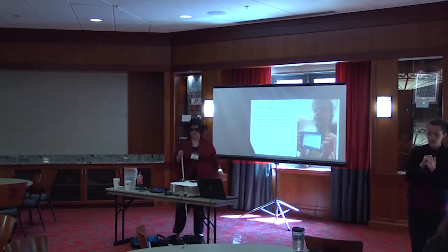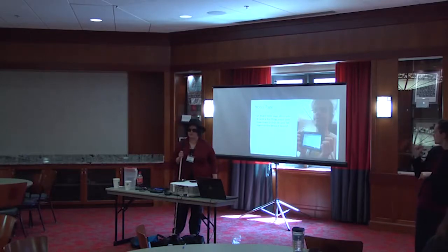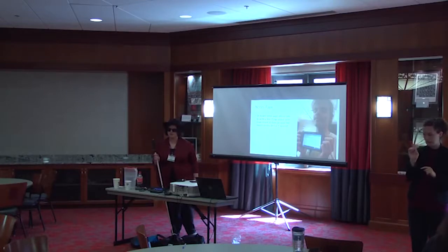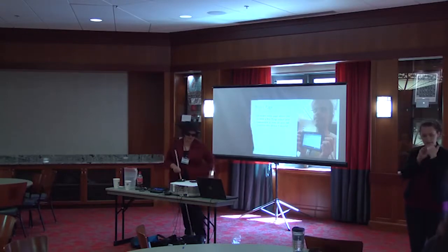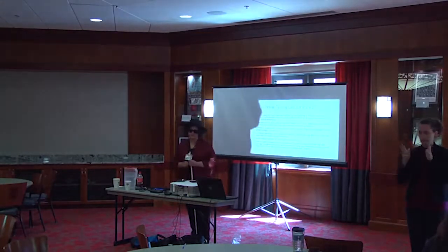But it is still eSpeak, so it's not that happy right yet. But we are working on that currently. Does that interface with any of the Braille Note Touches or any of those portable devices? We're working right now with Desmos and TI-84 to integrate a better calculator onto there and possibly make it into a note taker in the future. And that's something we're working towards.